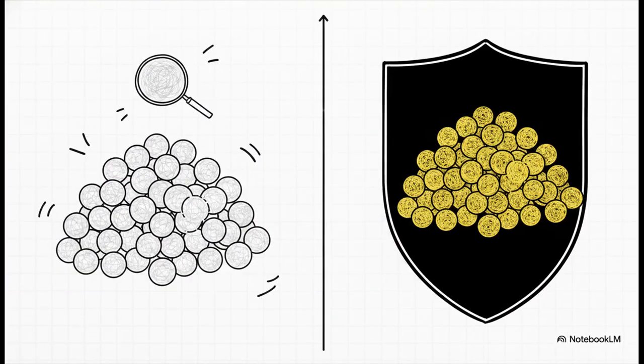And this whole idea is captured perfectly by Discipline Rule 2, sterility testing does not control the process. You know, a routine end product sterility test is, statistically speaking, incredibly weak. I mean, it only samples a tiny fraction of a batch, and it is entirely incapable of detecting a 1 in a million failure rate. And remember, that 1 in a million is exactly the standard we're aiming for. Instead, routine release has to rest on process evidence. Did every single unit in the batch go through the exact physical parameters we proved during validation? That is your real basis for release.